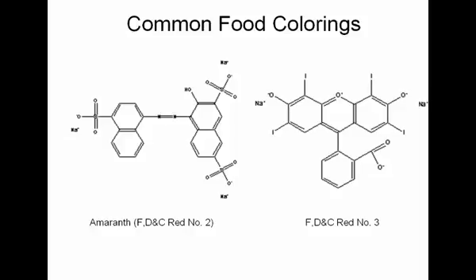All right, so that's the basics, the real basics of UV-Vis. Later on in the semester, we're going to make molecules with some conjugation in the aldol condensation reaction, I think. We're going to make one that's a really purple color. It's tetraphenyl cyclopentadienone. It's got lots of conjugation, and it'll almost look black, but it's actually a dark purple.